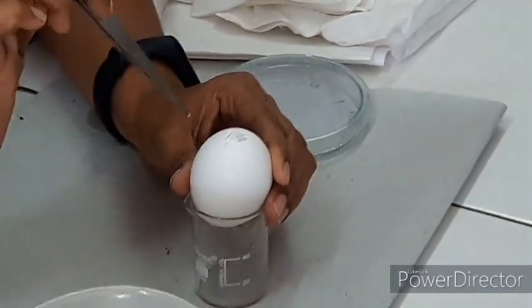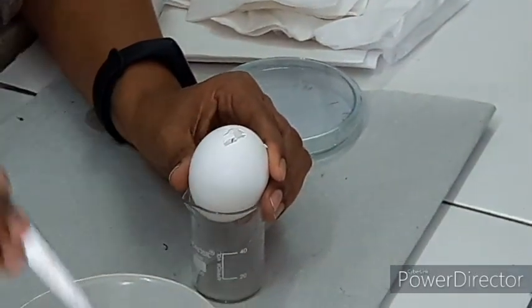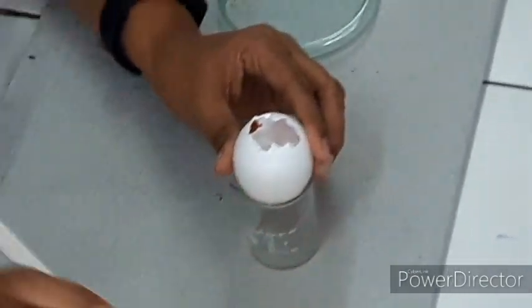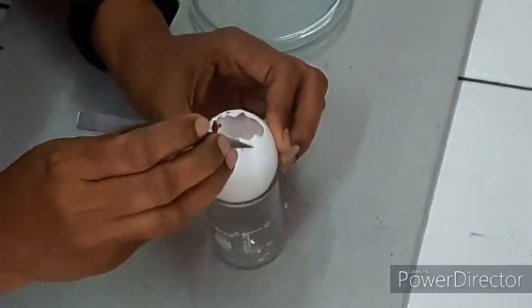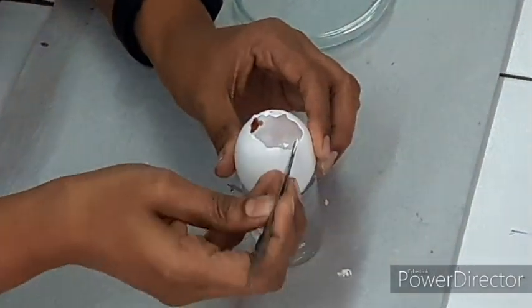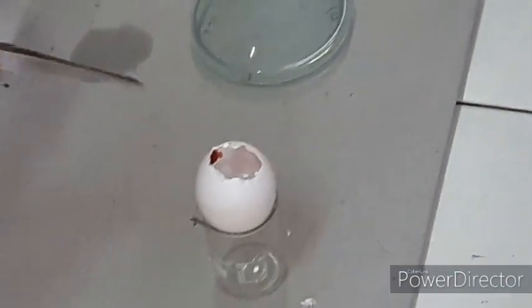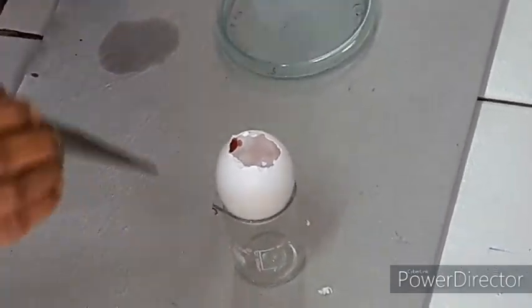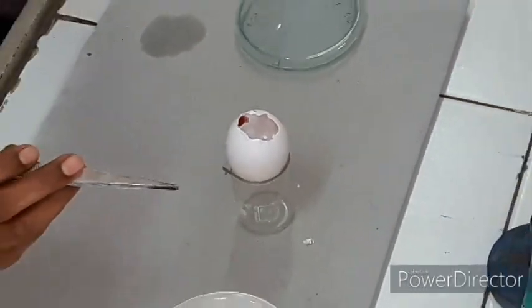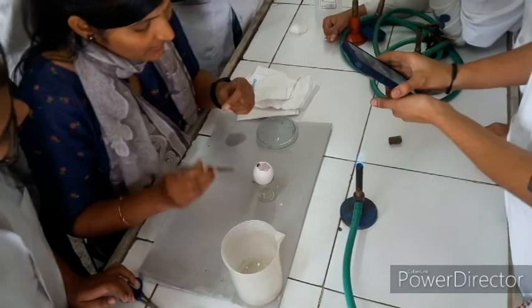The egg is cut with the sterile forcep and the shell membrane is removed. When the shell is removed, it exposes the shell membrane of the egg. We then have to very carefully use the sterile forcep to remove the shell membrane.